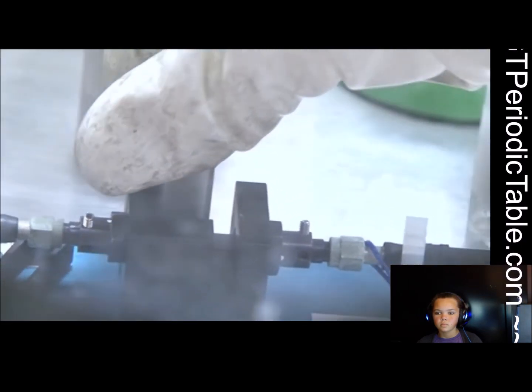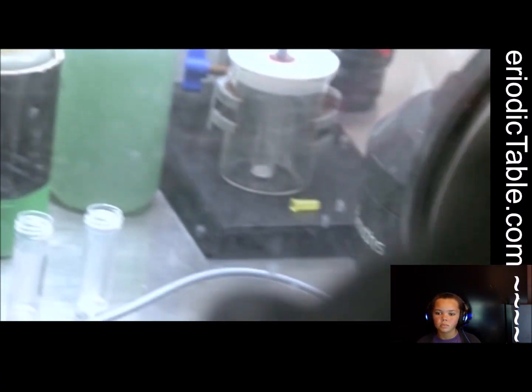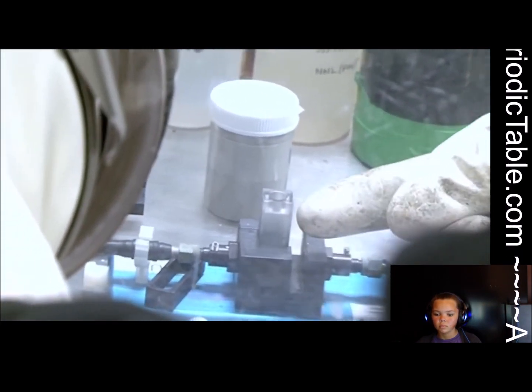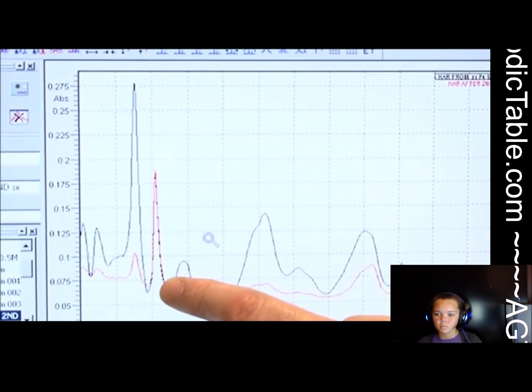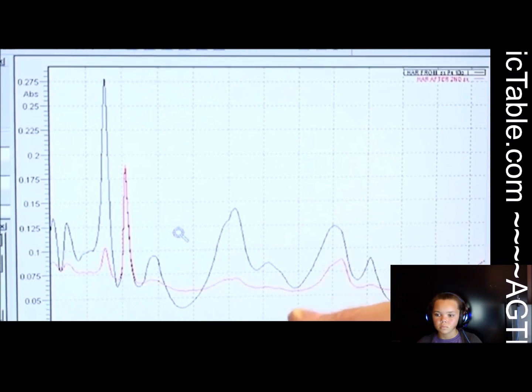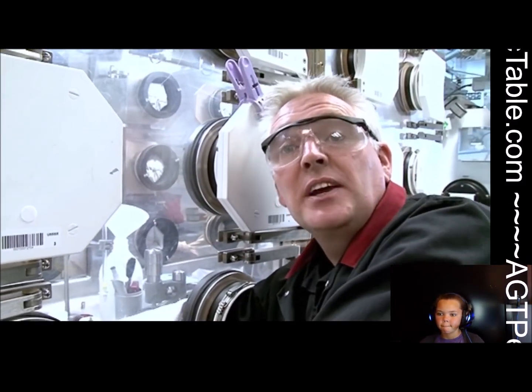This is actually an ultraviolet visible spectroscopy cell, and it goes into this holder, which has two fibre-optic connections to it. We pass light from the spectrometer through these fibre-optic cables, through the solution, and out the other side. The spectrometer provides a fingerprint of what element is in that solution, and that fingerprint is very specific to americium.